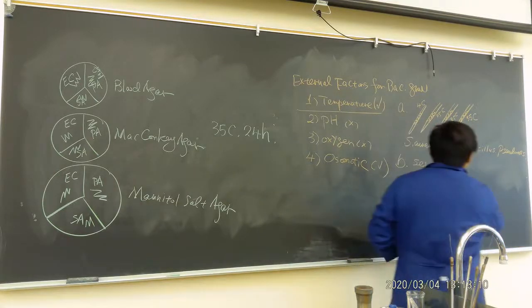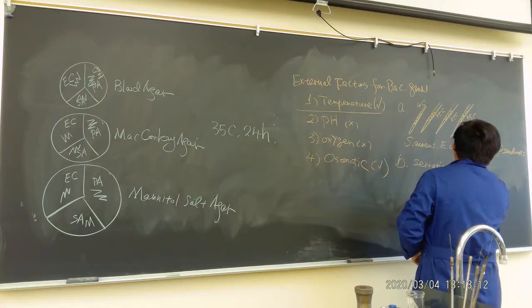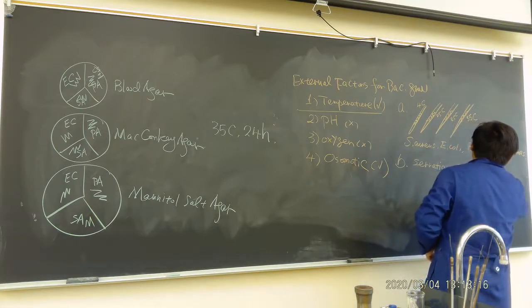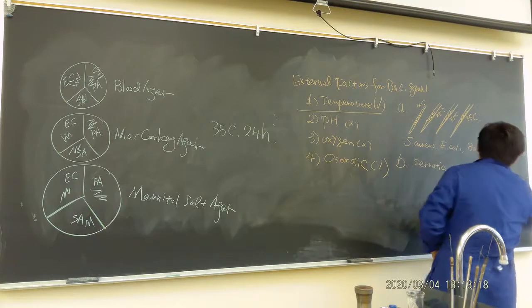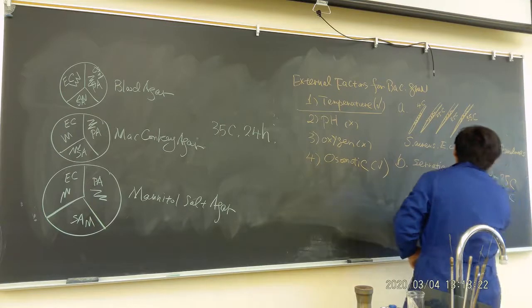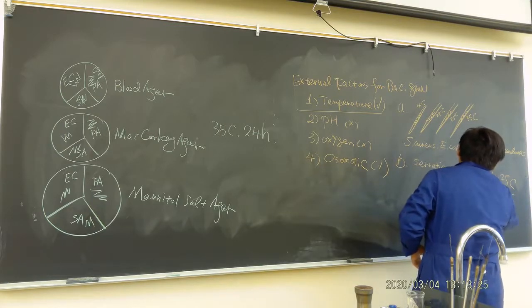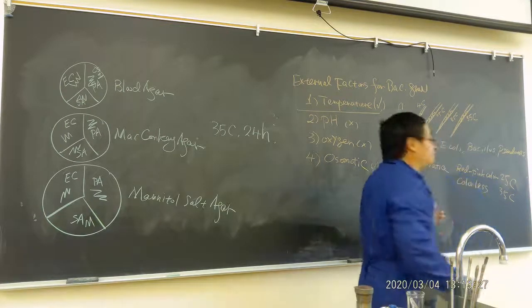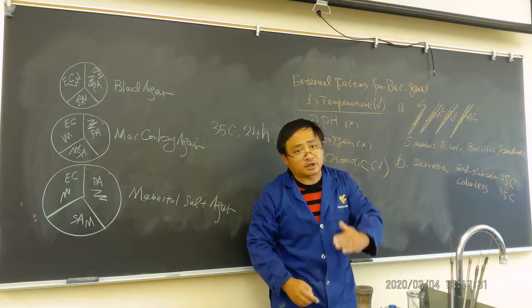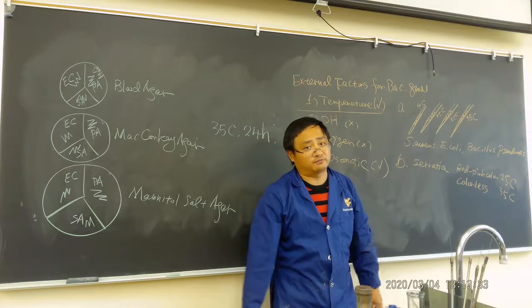This bacteria will show you red to pink color at 25 degrees Celsius. And at 35 degrees Celsius, it is actually colorless. So this bacteria is kind of interesting, and it could be used as a tracing marker for some purposes.